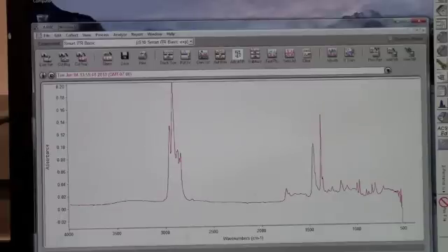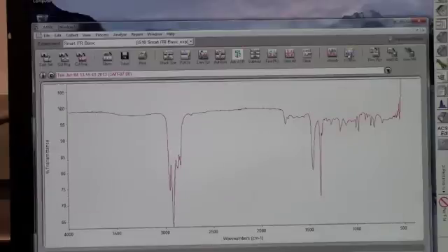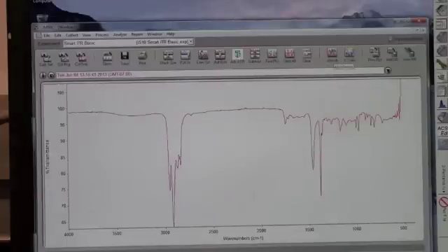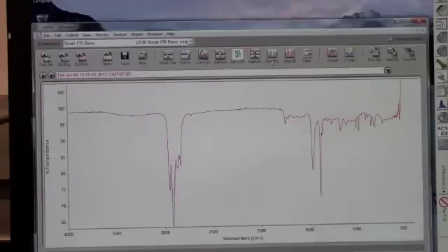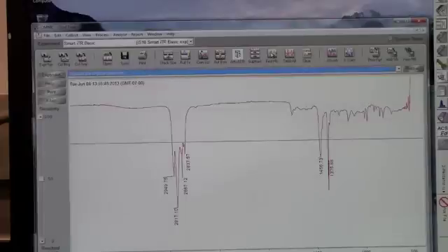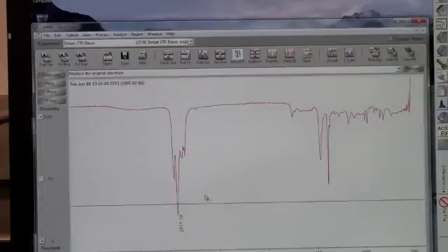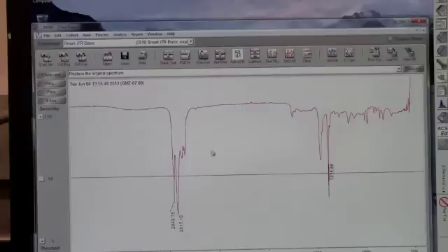Press Ctrl and T or click percent transmittance. This will invert the data. Finally, you can click the Find Peaks button and then drag the line to include or exclude certain peaks. This will find and label significant peaks on the spectra.